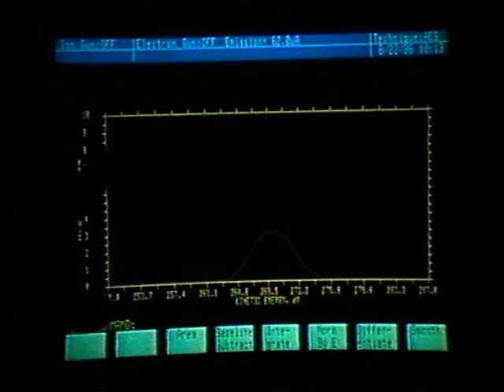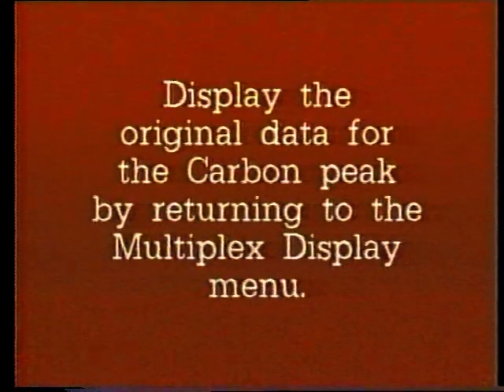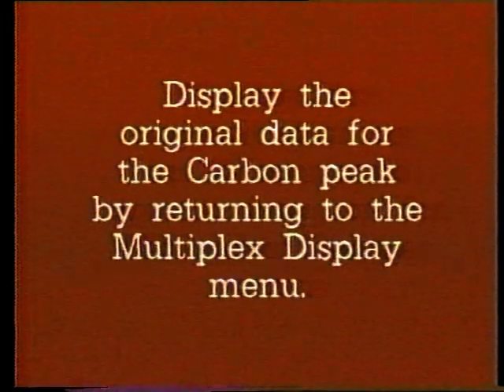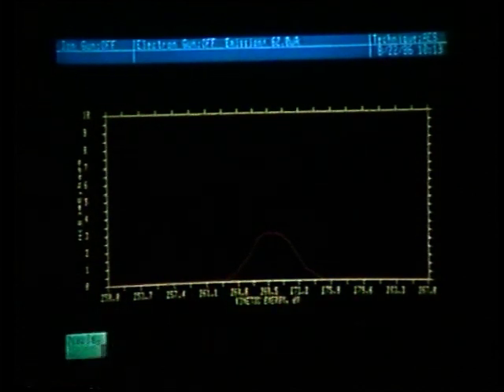What I would like to do now is redisplay the original data for the carbon peak. We want to get back to the multiplex display menu. To do that, we hold the soft key and press function key number 15, which will re-enter the display menu.